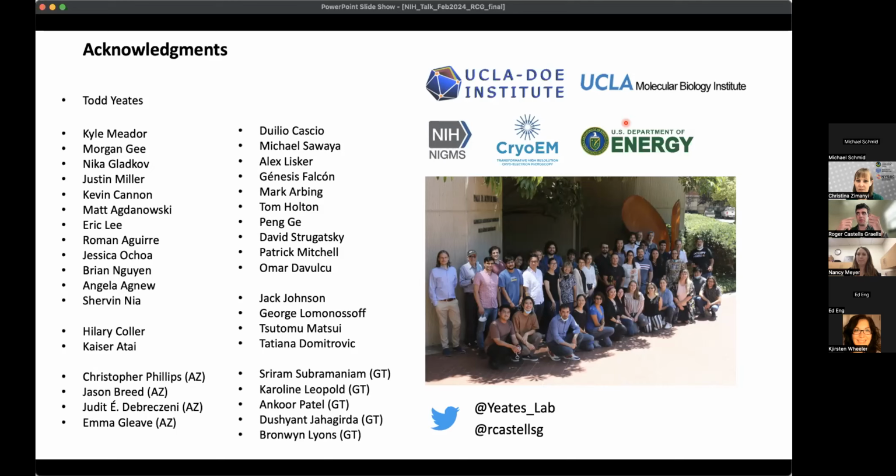And in each one of these rounds of selection, you keep those that have the highest or stronger affinity against your target. Then you do multiple rounds, and in the end, you sequence your best targets, and then you express the DARPins that encode for those particular ones, and then you test the affinity against your cargo. And then you check, for example, the KD.